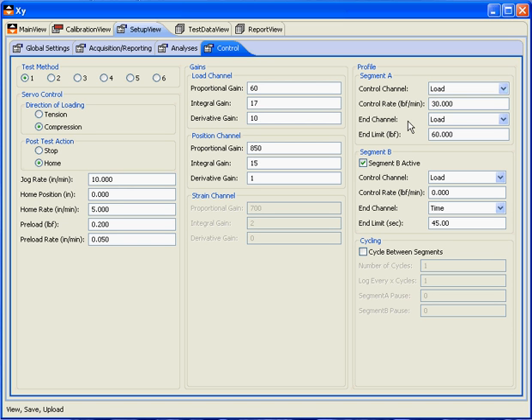Our end channel is the load we want to stop at, and again, this load will be calculated based off the PSI we want it to reach.